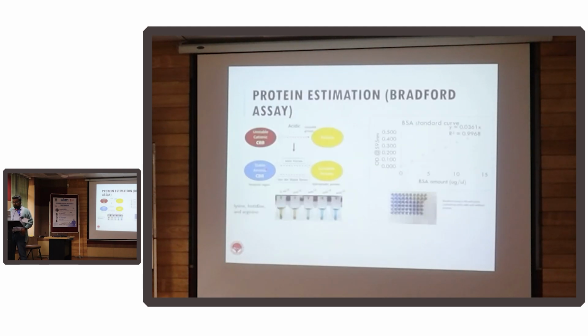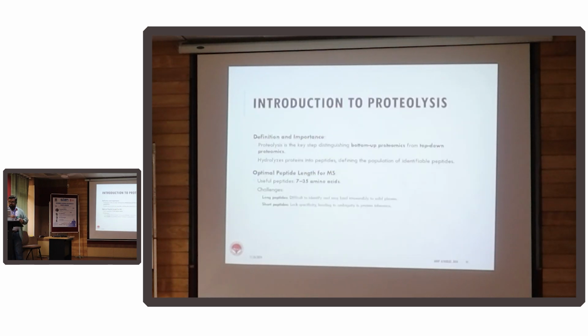So I will skip. This is what a Bradford assay looks like. This is what we used to do at the proteomics lab. You do it on a microplate, and I think most of you would have done a Bradford assay, but that has nothing to do with proteomics as such. Next, we will move on to a section called proteolysis.